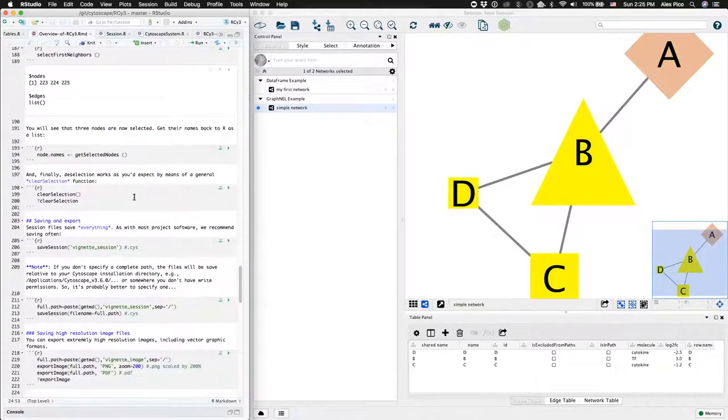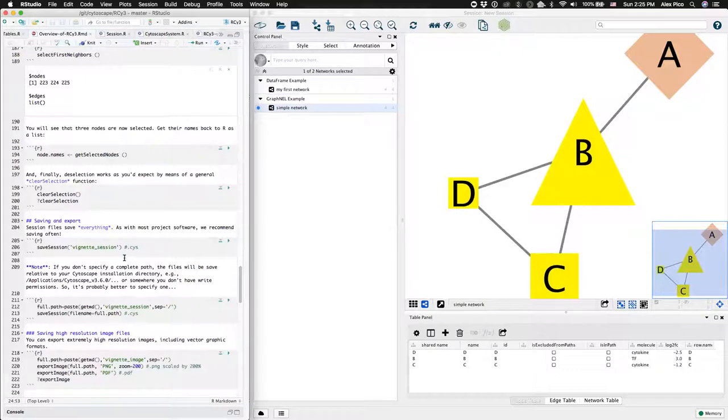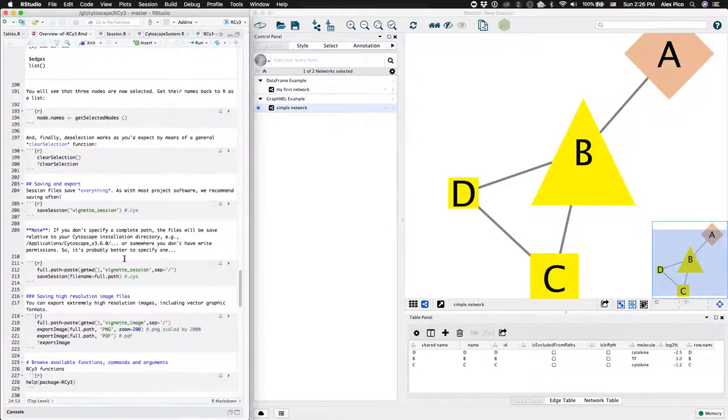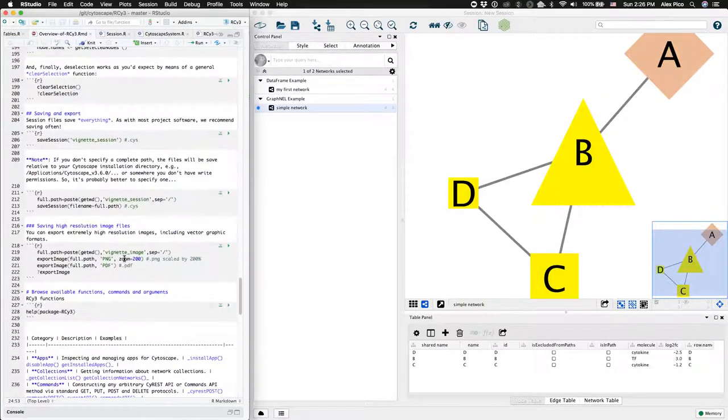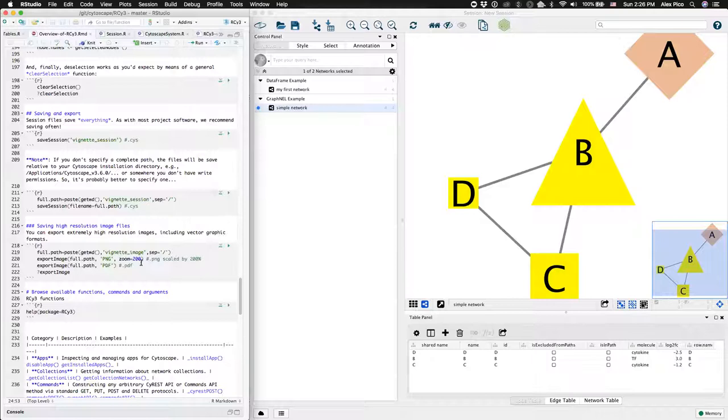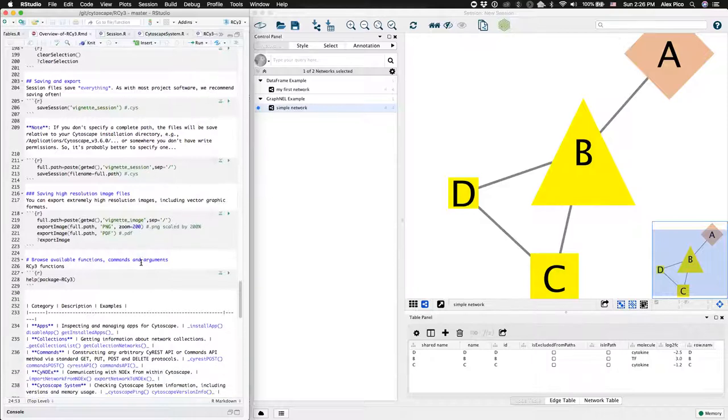Clear selection, saving the Cytoscape session, exporting images. These are all covered in the vignette.